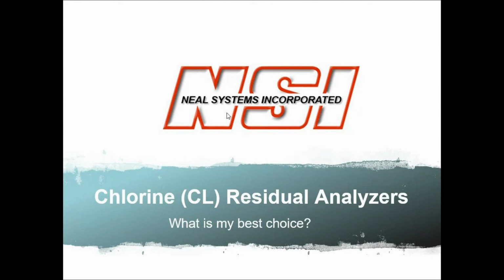Chlorine residual analyzers. So what is my best choice? I'm going to help you determine what might be the best choice for you in a chlorine residual analyzer.